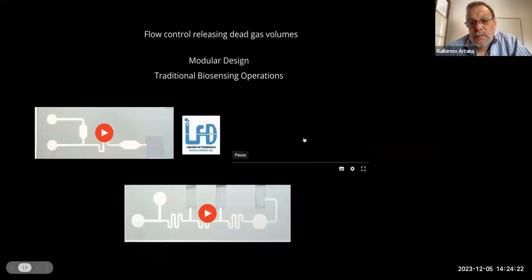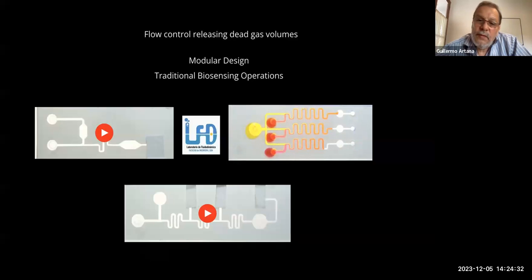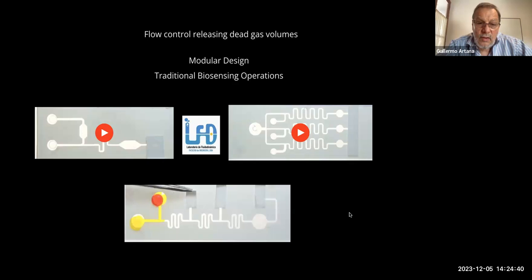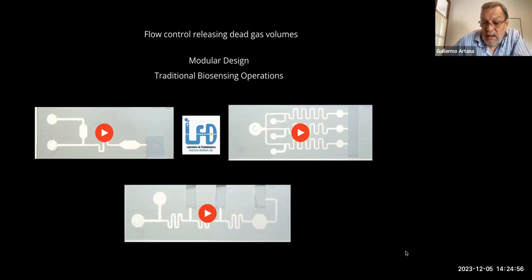Also here there's another example. You can produce different gradients of the fluids. So these are possibilities that you can go ahead with.